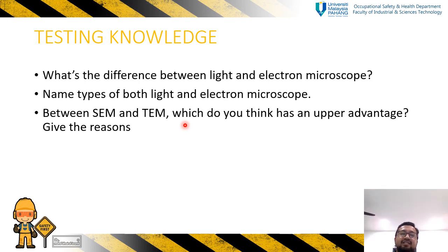Okay, lagi? Kalau SEM ni spesimen tu mungkin dia tidak boleh rosak. Image dia mungkin bagus, dia tidak boleh rosak. Kalau transmission dia punya image mungkin boleh rosak. Okay, alright. Okay, tak apa, good. Tak apa. Lepas ni you baca balik kan. Okay, thanks. Ada lagi rasanya?